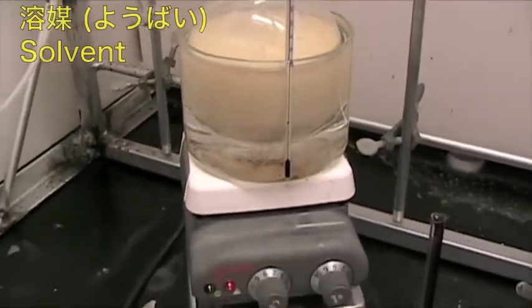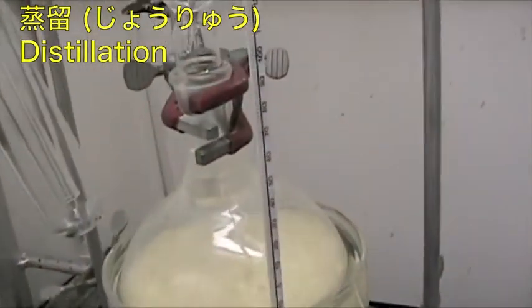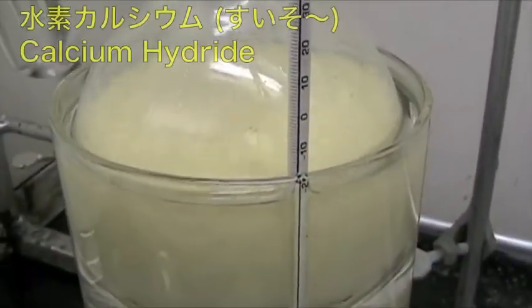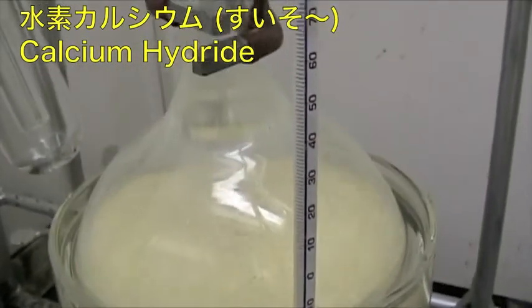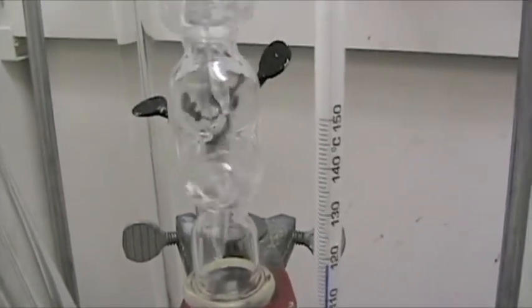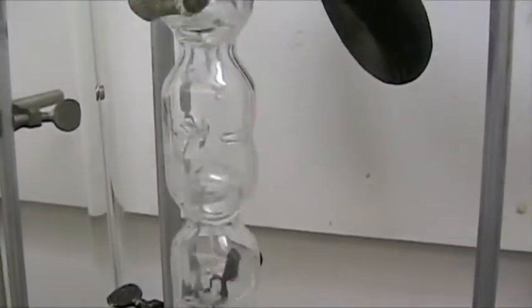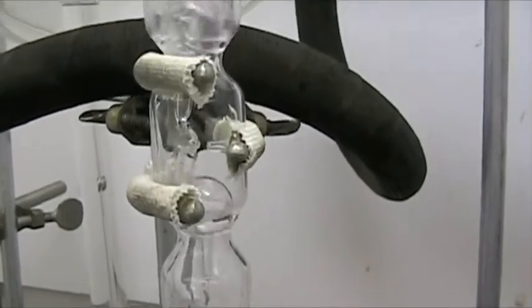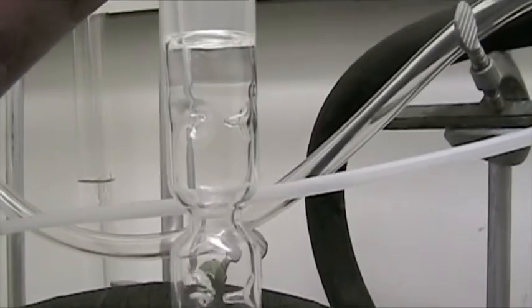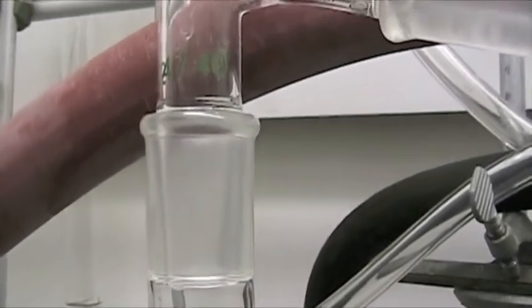One of the things that we have to do for our solvents, especially if they're coming out of a bottle that has already been opened, is we have to pre-distill them before they can go into our solvent still. So down here we have triethylamine, which is being heated in this flask with calcium hydride. From there it goes up into this column. The heated gas goes up the column and the cooled liquid comes back down until it reaches a state of equilibrium. These glass beads help improve this equilibrium.